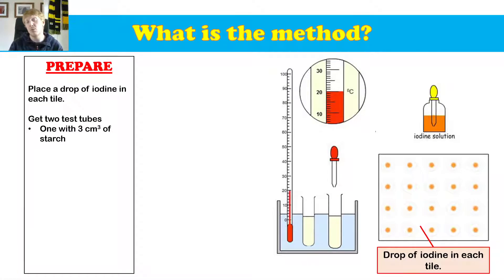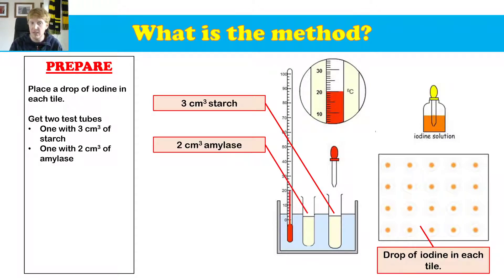We're then going to get two test tubes. In one of the test tubes, we're going to put three centimeters cubed of the starch solution, and you can see it just there in that water bath. In the other test tube, we're going to put two centimeters cubed of amylase.